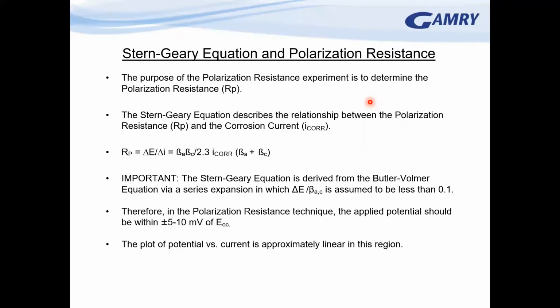The polarization resistance experiment is designed to determine the polarization resistance, Rp. The Stern-Geary relationship describes the relationship between the polarization resistance and the corrosion current.